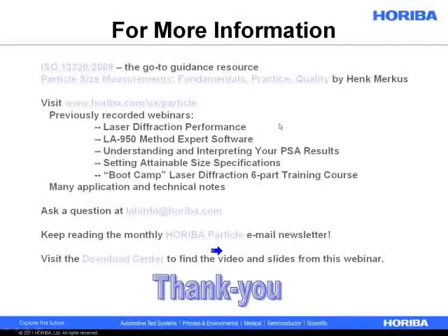What I was going to say was, if the particles are large enough that it's really only the red laser that's doing the investigation, then you have to care about the color. If they're both small enough that it's only the blue light that's doing the investigation, then again you have to care about the color. But in the case of titanium dioxide being sort of water white and carbon black obviously being black, neither of them are really colored in that sense, and they'll react about the same way, more or less, to the blue light and the red light.